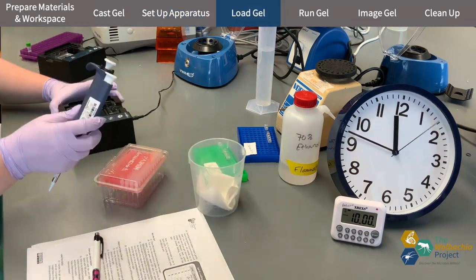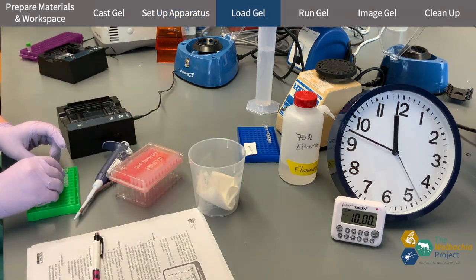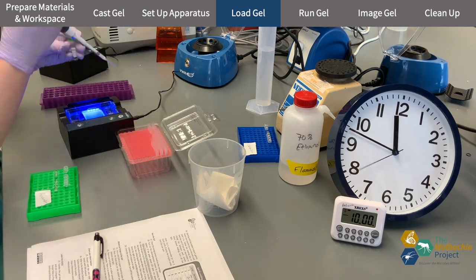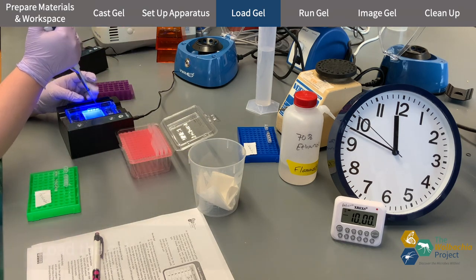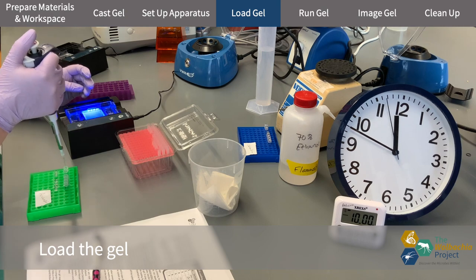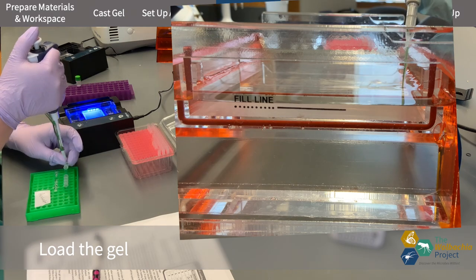Once you're ready, move on to loading the gel. You can turn on the blue light to watch where you load your samples. Here, I'm starting by adding the ladder to the first well, then adding my samples.